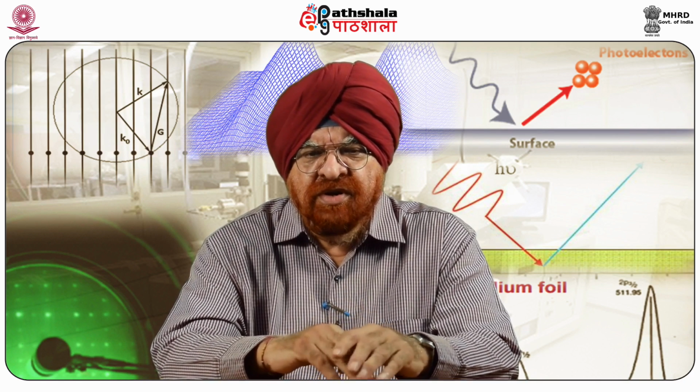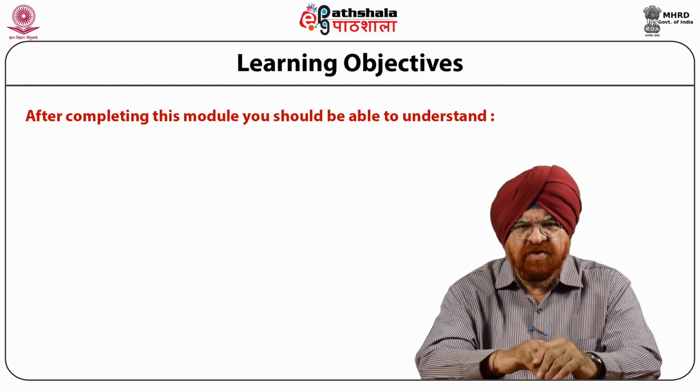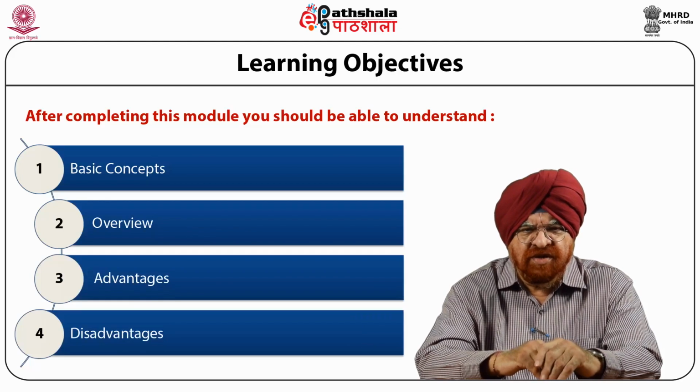Today, we are going to discuss the module Magnetic Force Microscopy. We will deal with the introduction part in this presentation. This comes under the paper called Surface Analytical Techniques Part 1. When you finish studying this module, you will be able to understand the basic concepts, overview, and advantages and disadvantages of this particular technique.